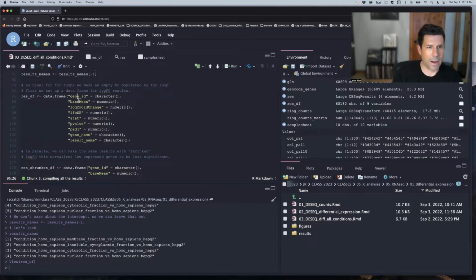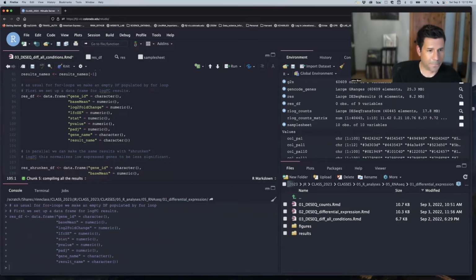So we can do that. And we're saying what we want them as, if they're a number or a character. That's always a good thing to do. You know, you can change it later with the mode function that we went over.